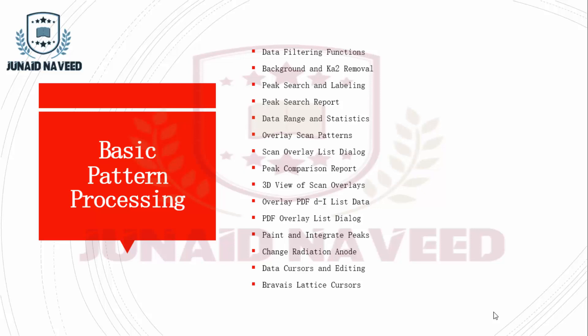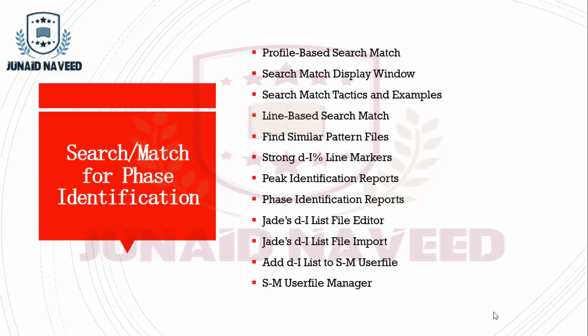In the search match module, we will be discussing profile-based search match, search match display, search match tactics and examples, and line-based search match for finding similar pattern files.